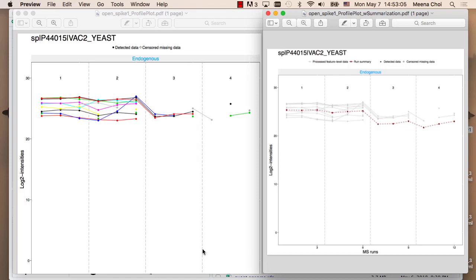So our imputation algorithm, based on this measurement, imputes the missing value here, somewhere around here, and this is the summarized value. Even though we only have values above this yellow line, because of the hidden imputed values, we can see here our final summarized value, and we use this value for our inference. Okay?